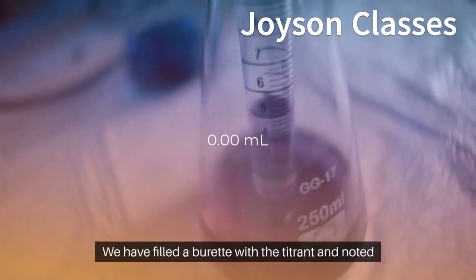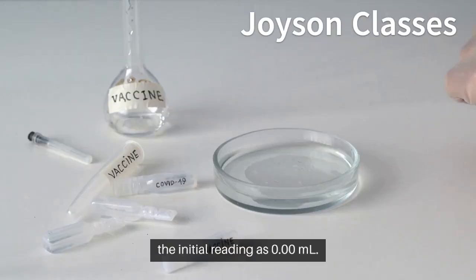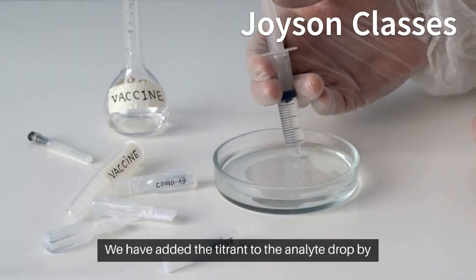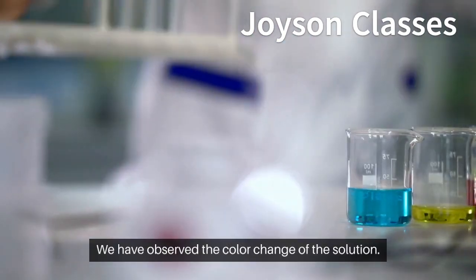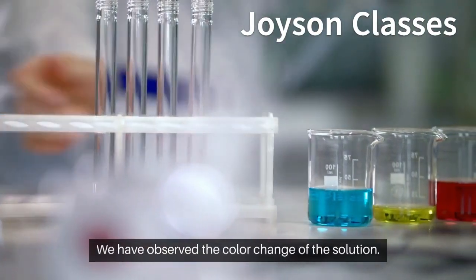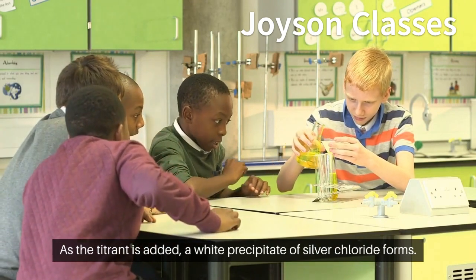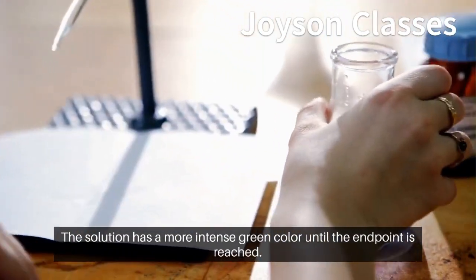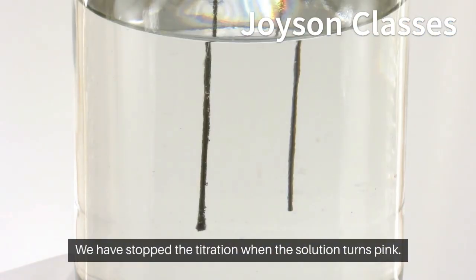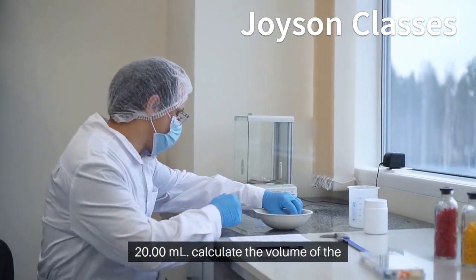We have filled a burette with the titrant and noted the initial reading as 0.00 ml. We have added the titrant to the analyte drop by drop while stirring the flask constantly. We have observed the color change of the solution. As the titrant is added, a white precipitate of silver chloride forms. The solution has a more intense green color until the endpoint is reached. We have stopped the titration when the solution turns pink. We have noted the final reading of the burette as 20 ml.